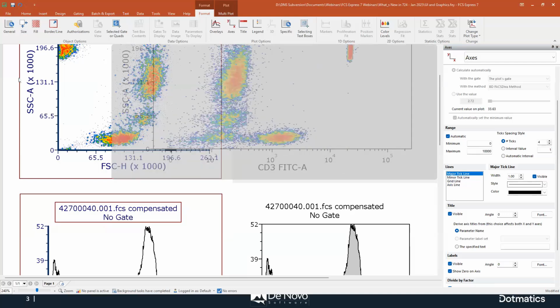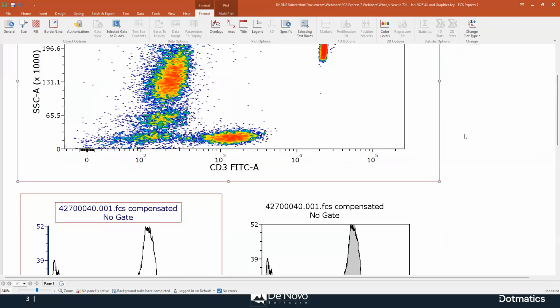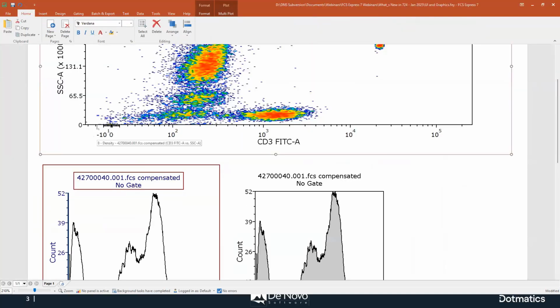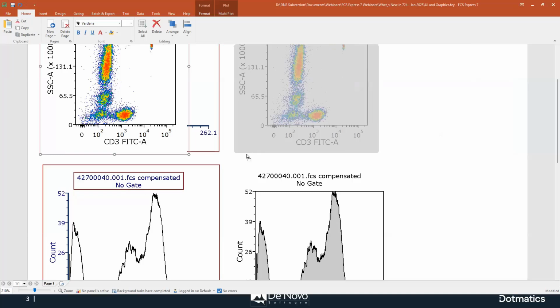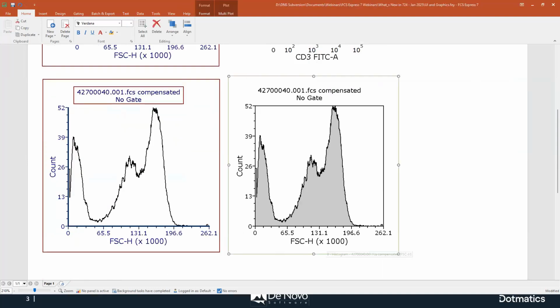And of course, if you resize the plot, let me do something crazy, super big, maybe you will reveal other ticks, but the 0 will have the priority. So the 0 will always be shown. This can be applied to any axis, X and Y, and also to the axis of histogram and all the other plot types. So it's not specific for any plot type.